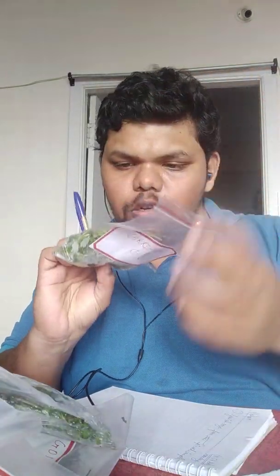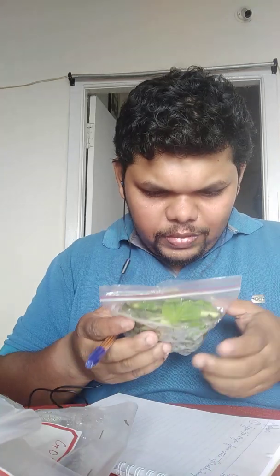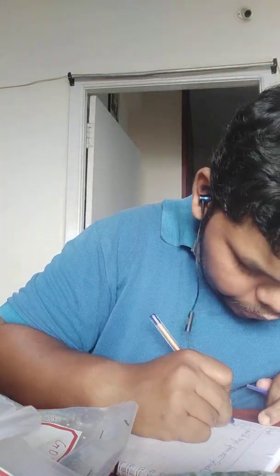And you can see the coriander sample still looks fresh in the light. Okay, the mint sample also looks very fresh. The curry leaves look a little bit dry, but that's okay, because ultimately we're going to dry these samples in the sun, natural light rather than artificial light. The garden greens, or totokura, also looks the same, with the greenish ooze.